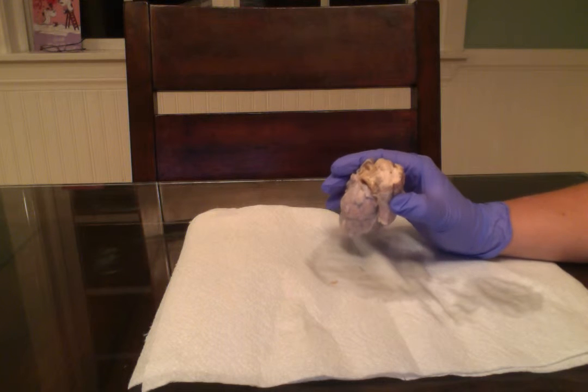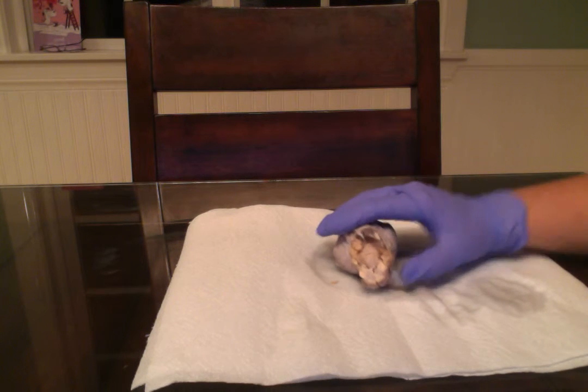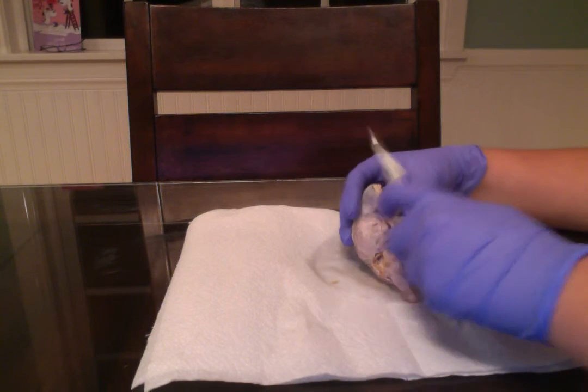We now need to look at the sagittal section. So to look at the sagittal section, I'm going to have to cut down the midline.